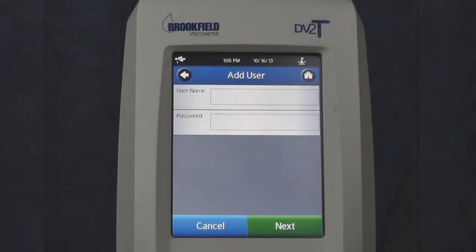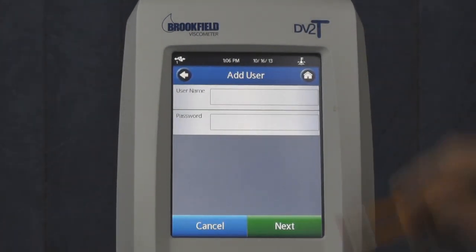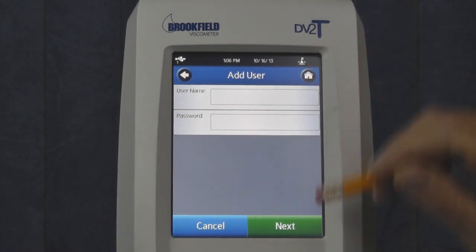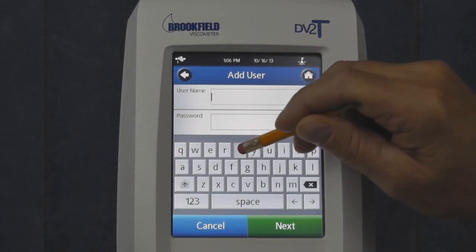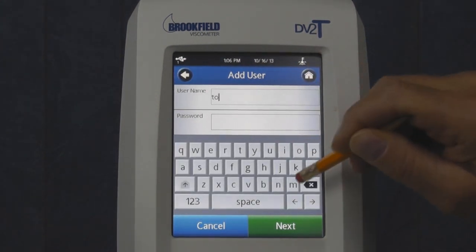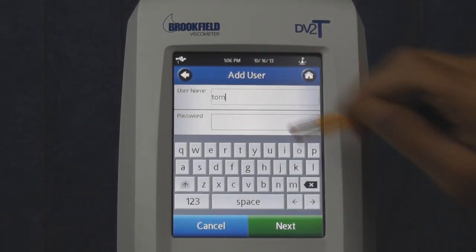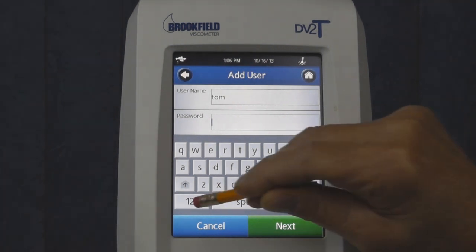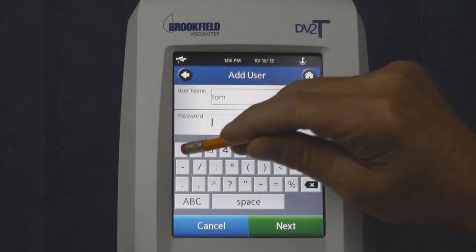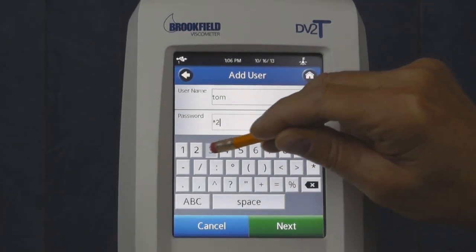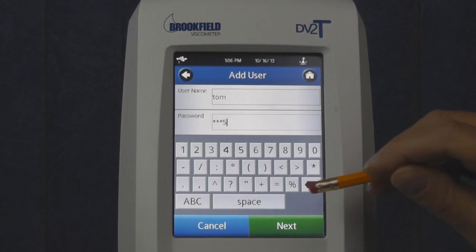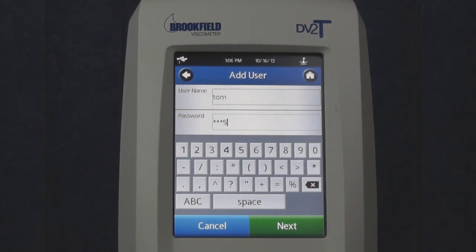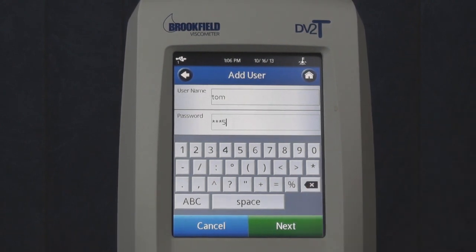In this screen, you'll add the new user's name and a temporary password of at least 4 characters. When complete, touch Next.